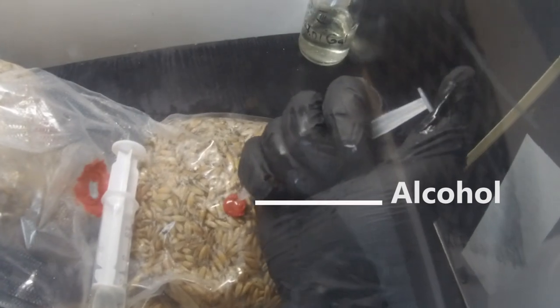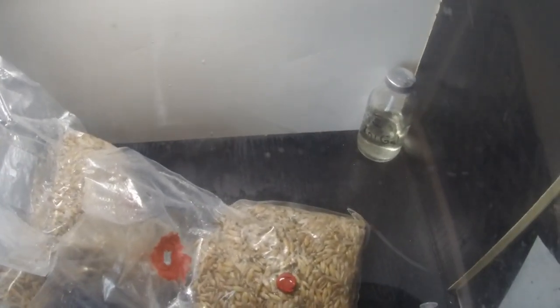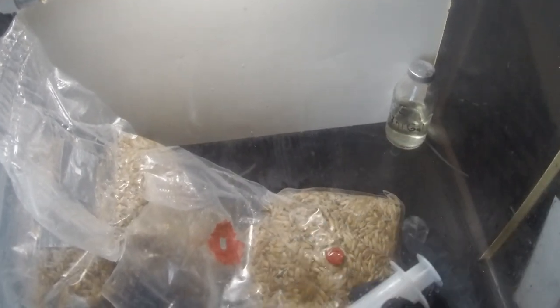Put some drops of alcohol onto the inoculation port. During inoculation, make sure that the needle goes through the alcohol drops. Never forget to write the strain and date of inoculation so you don't mix everything up. Put everything into the incubator chamber at 28 degrees for 2 weeks.